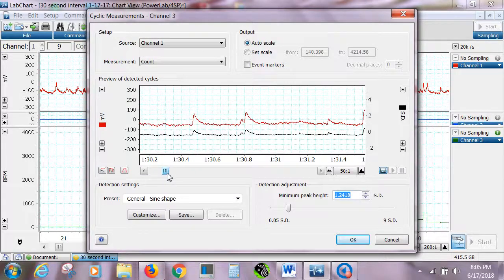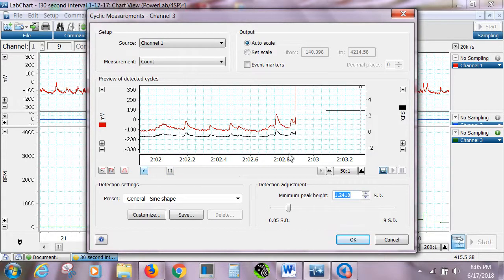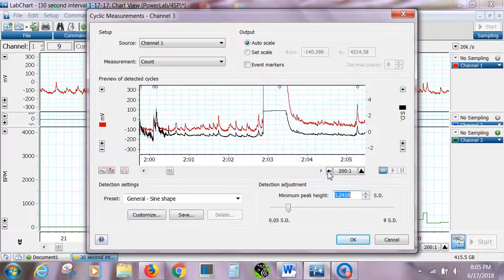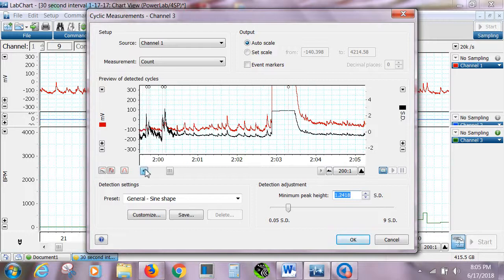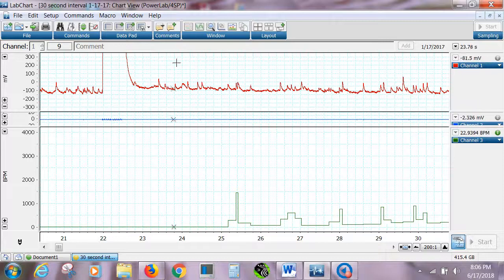And we can see that those are pretty clean, but now it's missed all these. So it's a real problem for doing it with an automated analysis across the line, because it's getting the large ones, but it's missing these, and if I get those, then I get all this noise that's in there. So this is the problem with using the software that comes with this program.